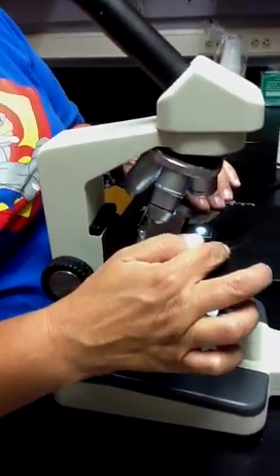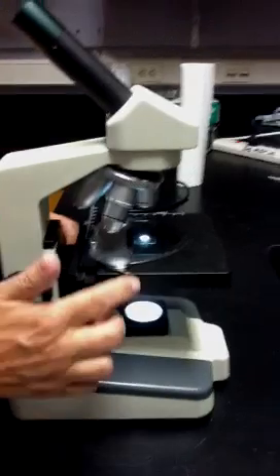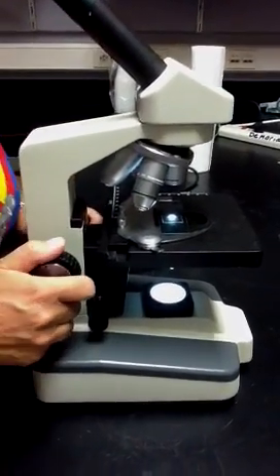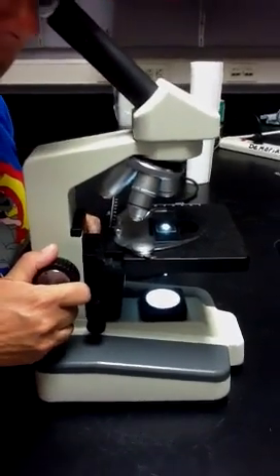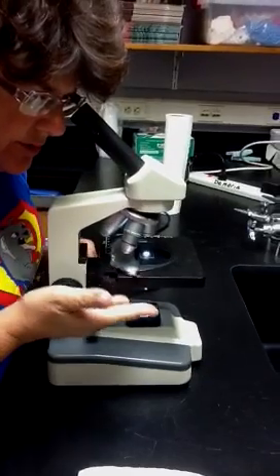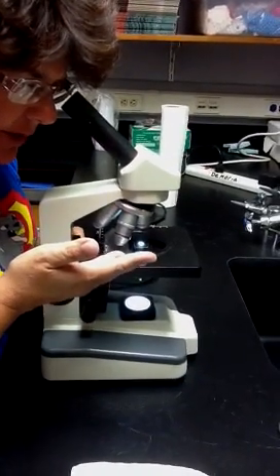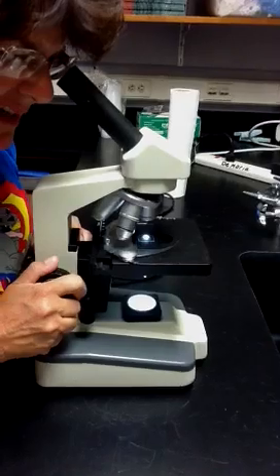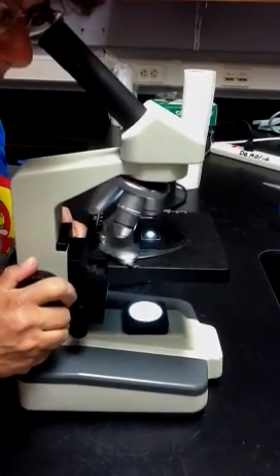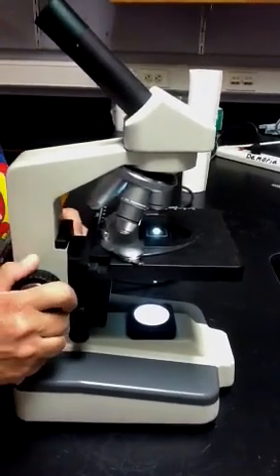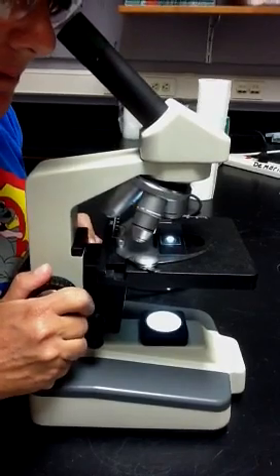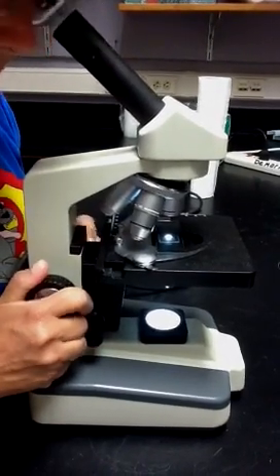Now, once you've got your slide in place, the stage all the way down, only use this course adjustment to start looking through the eyepiece. Slowly bring the stage up closer to the 4x objective lens. And you should see something appear in your field of vision. Sometimes you will just see dots, but you should see something appear.